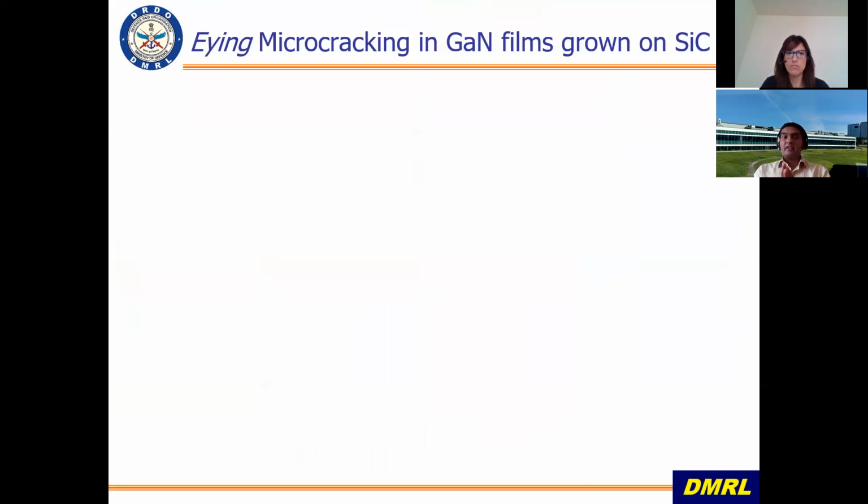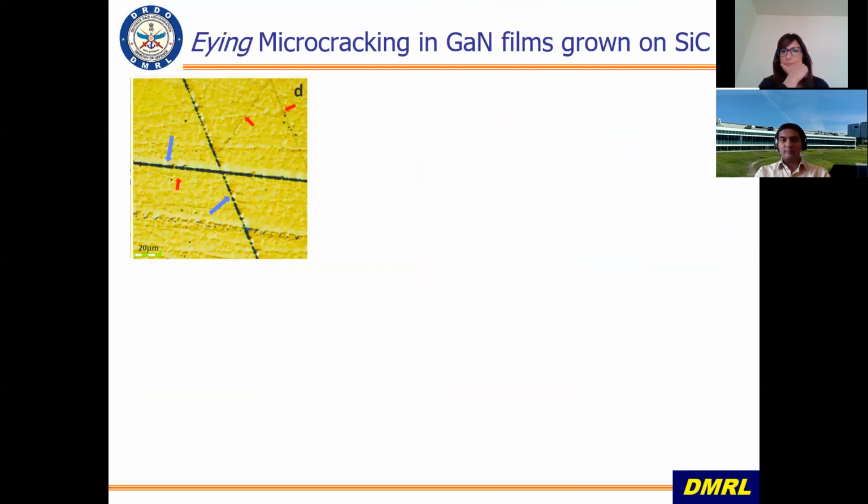Then this is another example where I was looking at micro cracking in gallium nitride films grown on silicon carbide. This is showing the Nomarski optical microscope image of a micro crack observed on a gallium nitride film. I wanted to study why these cracks develop in certain cases and why they do not develop in certain other cases.